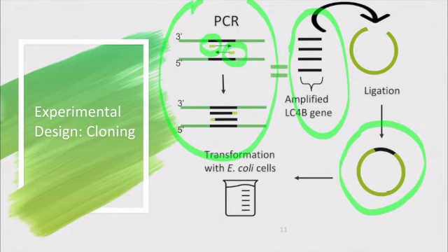We did this by creating holes in the E. coli for the plasmid to enter and sealing the holes back up by changing the temperatures. By subjecting the E. coli cells to high temperatures, we were able to create holes in the cell's membrane and compel the cells to take up our gene. After the gene was taken up by E. coli, we exposed the E. coli to a lower temperature to seal the holes created by the high temperature. This created E. coli cells that contained our gene of interest, which allowed for a system of more and more gene of interest to be formed.